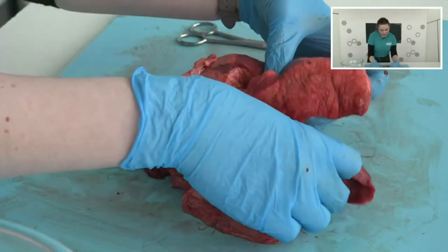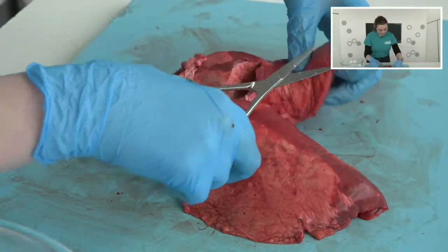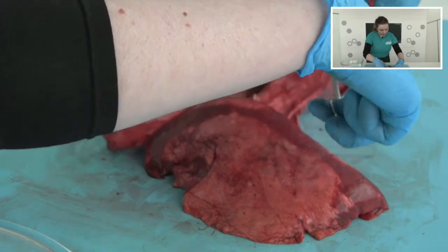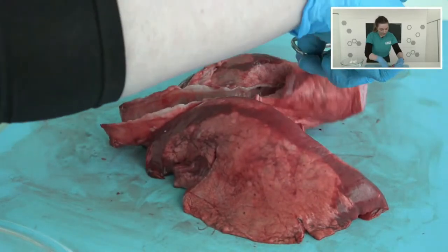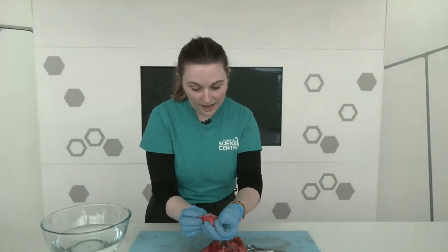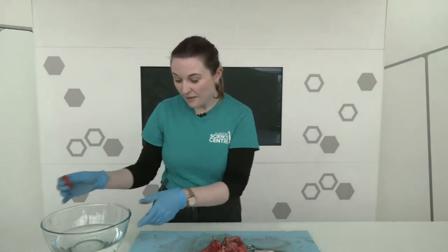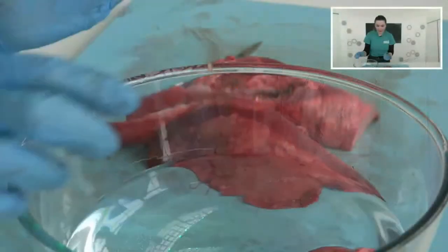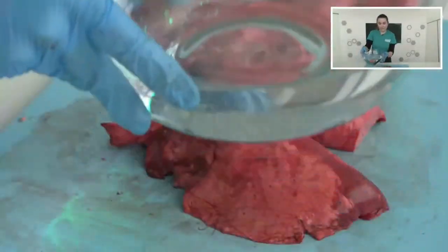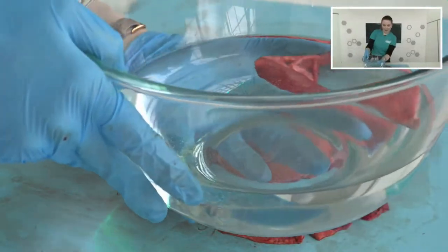That is a good look at our lungs. I talked about it being spongy — I can actually show you just how spongy it is. I'm going to cut off a section. Because it has all of these little spongy parts that are really, really good at holding air, we've got a lot of surface area in our lungs. If I put a little bit of lung in the water, you'd be able to see that it floats — it's buoyant. There we go — you can see it a little bit better on camera.